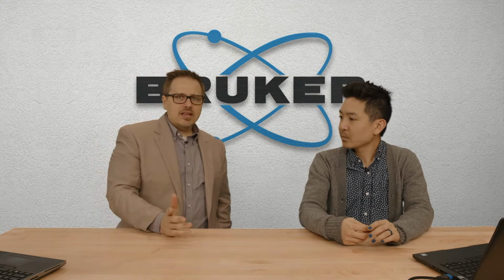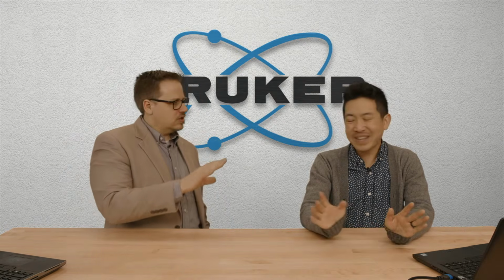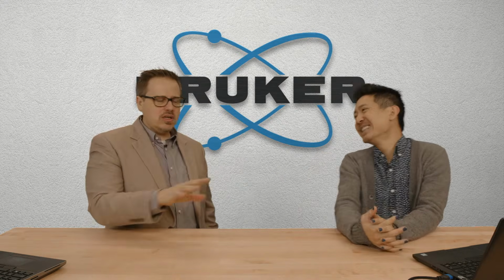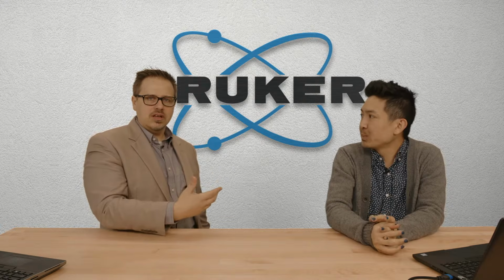It's like if you want to use RIR, you have to use peak intensity. If you'd like to use something like area, then you need to be looking at other data handling. Yep, and that is one feature. It will take way too long to go through today, but you can actually use this. Quantification is a 4-day class. Yeah, you can use this fitting feature though in EVA with the patterns, where you can actually fit, and it does take into account some of these things.